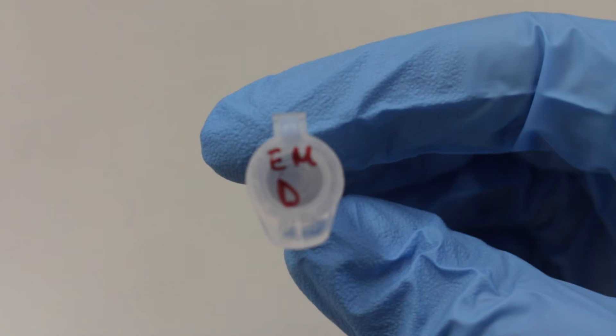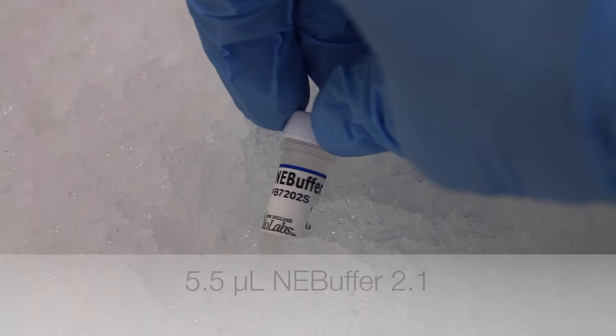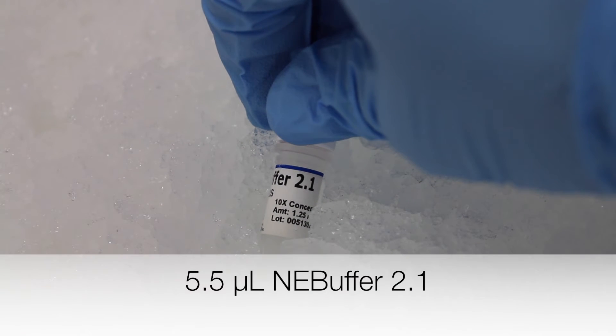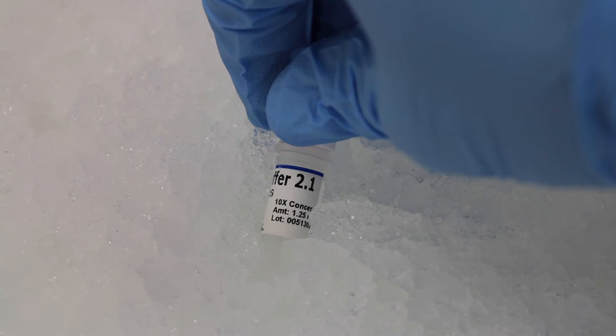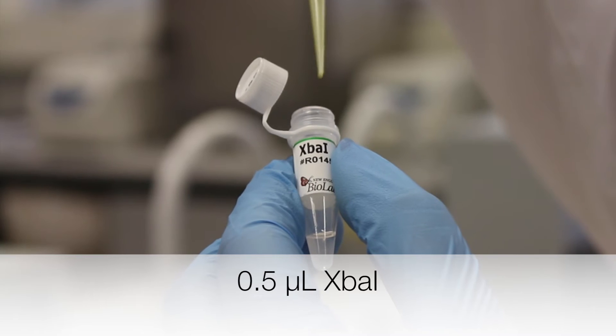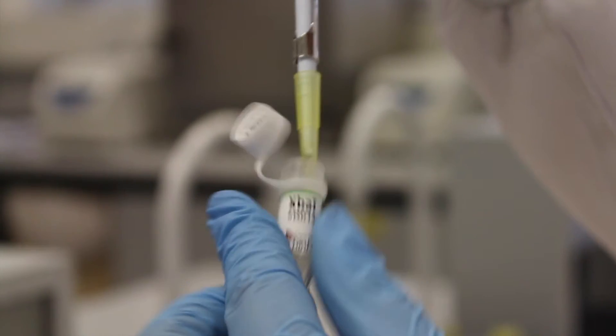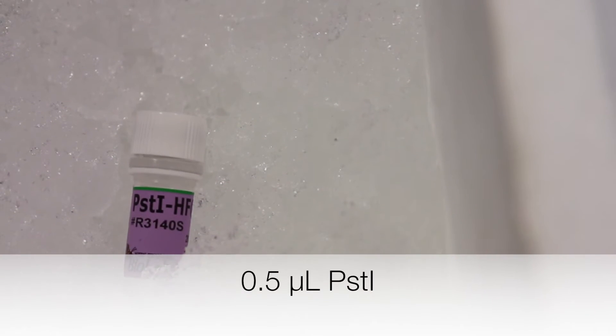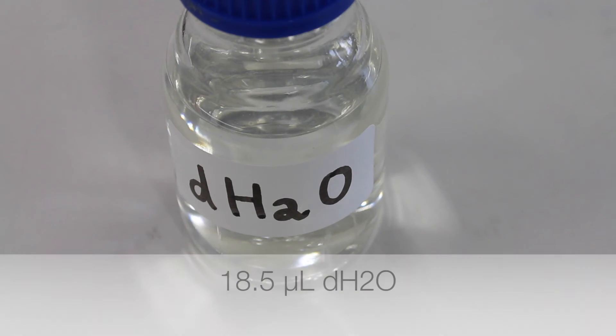The enzyme master mix for the downstream part will contain the following: 5.5 microliters of NEB buffer 2.1, 0.5 microliters of XbaI, 0.5 microliters of PstI, and 18.5 microliters of distilled water.